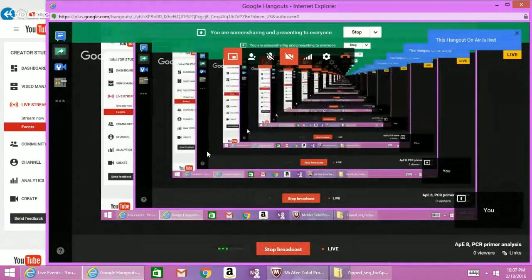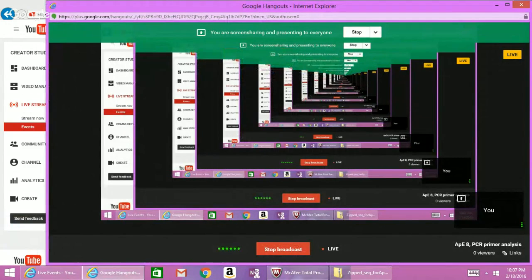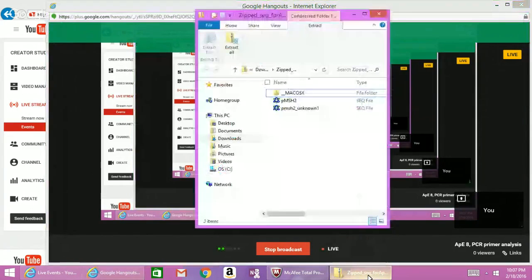Hi, in this video I will be using APE to do a primer PCR analysis. Okay, let's get started. First, you're going to want to download a file from Moodle named zip sequence for APE. It contains a wild type and our unknown sequence.